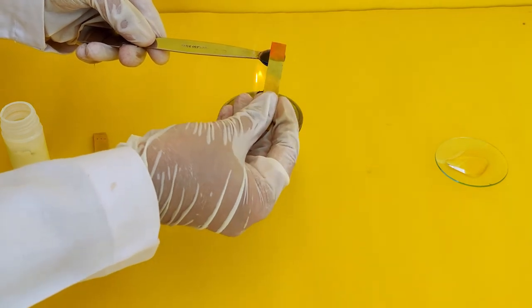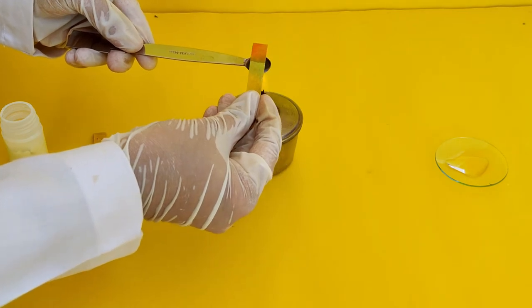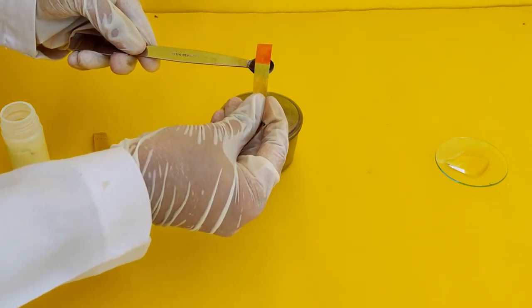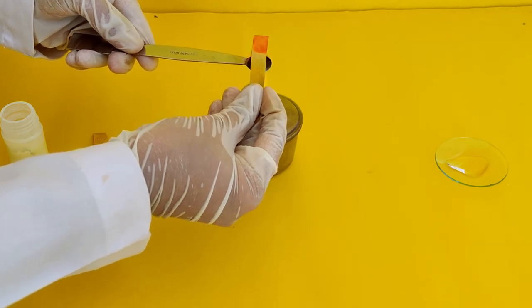You will see the pH paper turns orange in color. This shows that the sulfur dioxide gas released through the burning or oxidation of sulfur is acidic in nature.